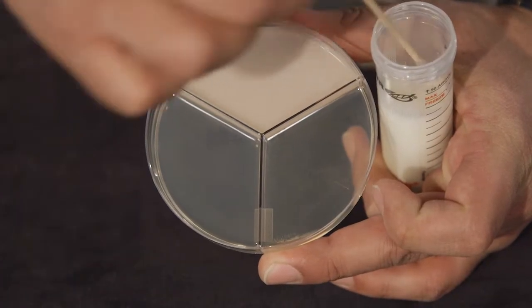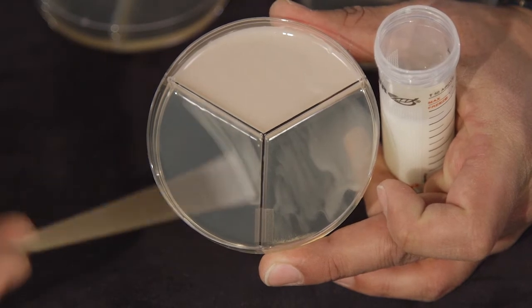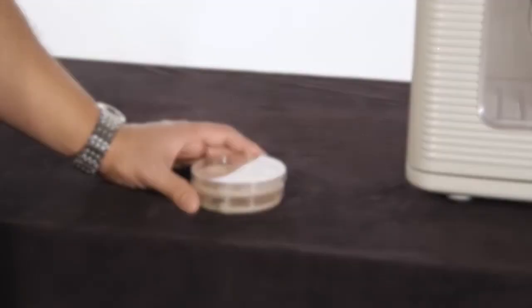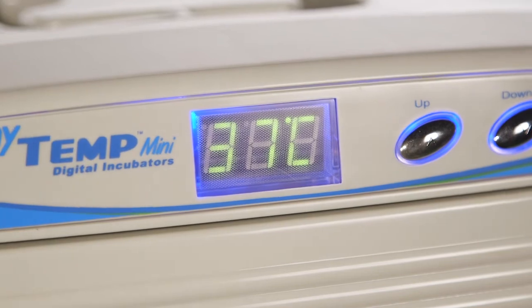We're going to saturate the surface of the media with your milk sample and repeat this process for each section of the media. Our samples are now ready to incubate. You incubate the samples at 37 degrees for a period of 16 to 20 hours.